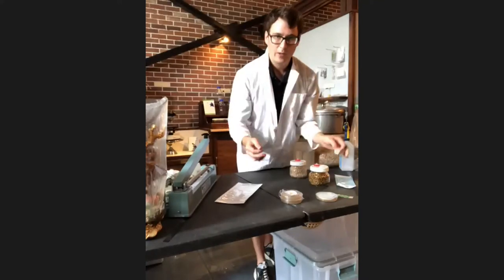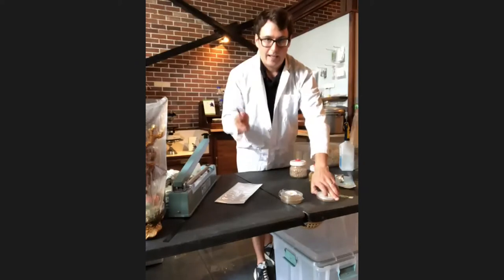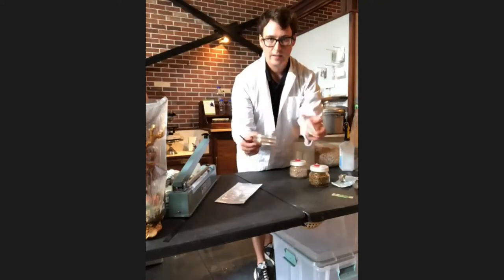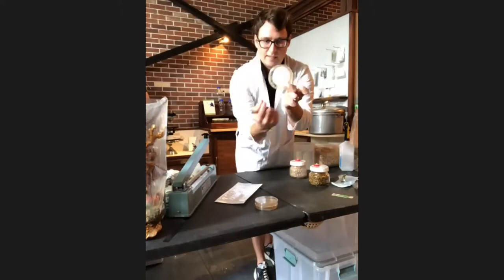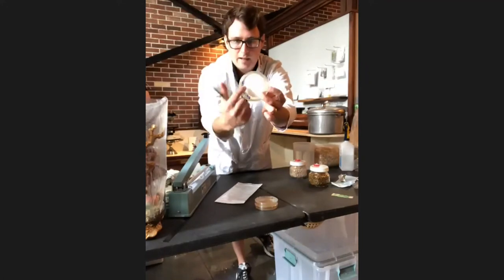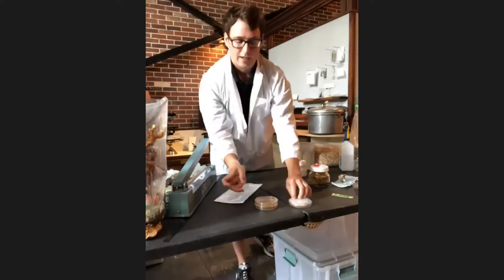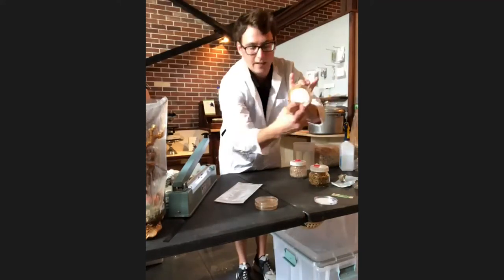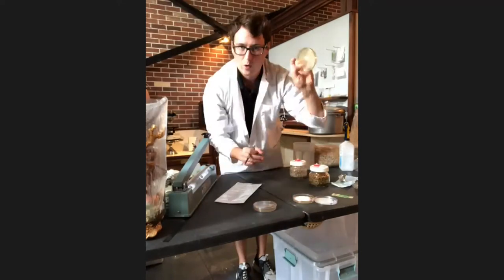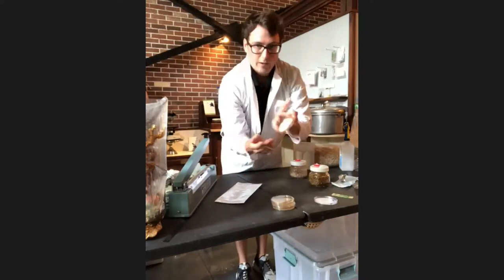The purpose of agar-to-agar transfer is to keep a stock culture to continue your production. Normally I'd perform these operations under a laminar flow hood — a sterile condition — but I'll demonstrate a simple transfer here. On this plate, the mycelium starts at the center and grows toward the edge. I want to take a piece from the outer edge because that's where it's actively growing and is the most sterile part. I'll cut a small wedge and place it onto a new agar petri dish, which will grow out in a couple of weeks.